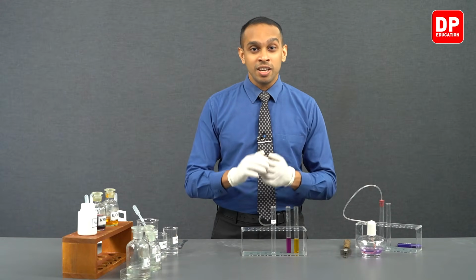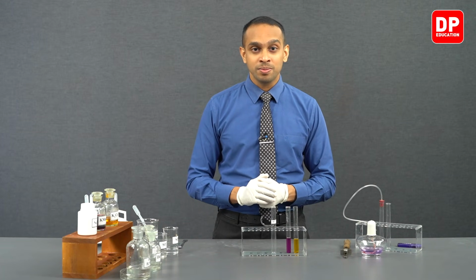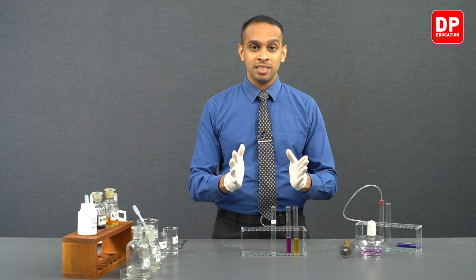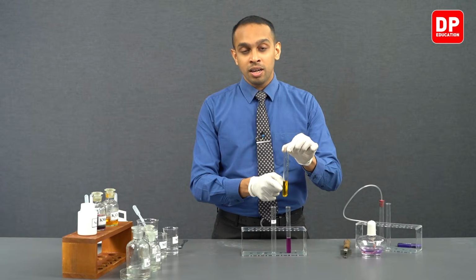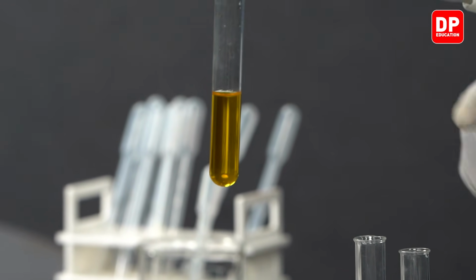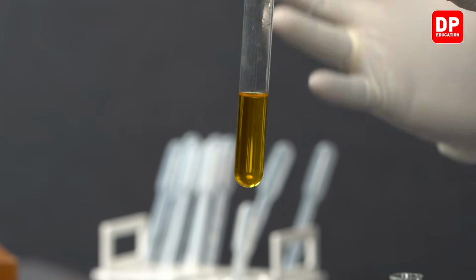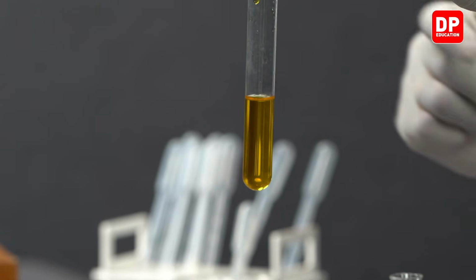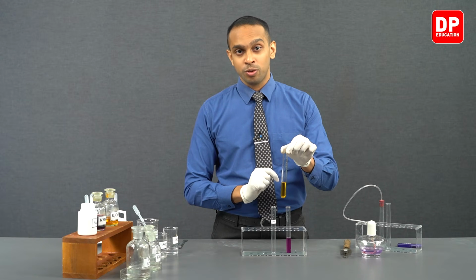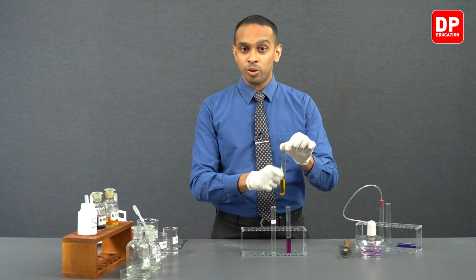When sulfur dioxide gas comes into contact with acidified potassium dichromate, sulfur dioxide gets oxidized to sulfate ions, while the dichromate ions get reduced to chromium 3 plus, which results in forming a green color solution. So when we send sulfur dioxide gas through acidified potassium dichromate, you can observe the color change of this solution from orange to green.